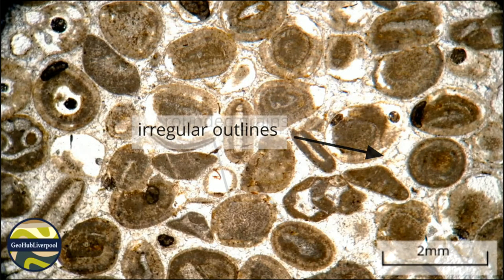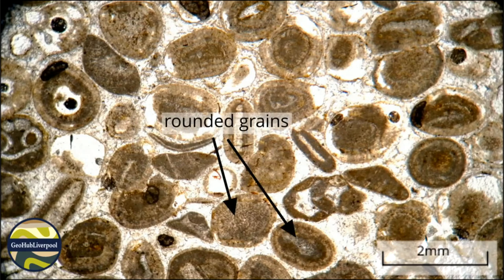Most of the grains are rounded and they are of about the same size — approximately one millimetre in diameter. Many are almost spherical, although some are more elongated.